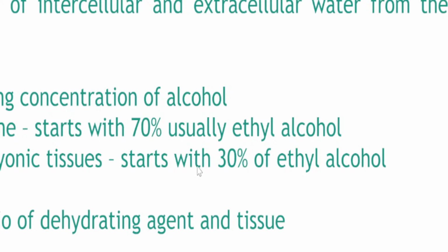Okay, next, dehydration. Dehydration is the removal of intracellular and extracellular water from the tissue. What is the purpose? We want to what? Dehydrate a sample to prevent it from rotting, right? Or to prevent it from what?